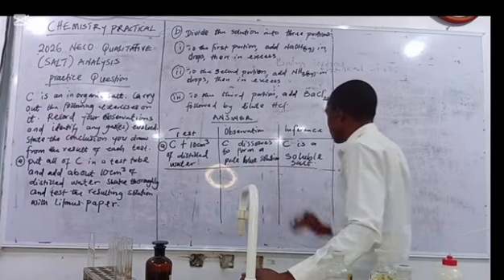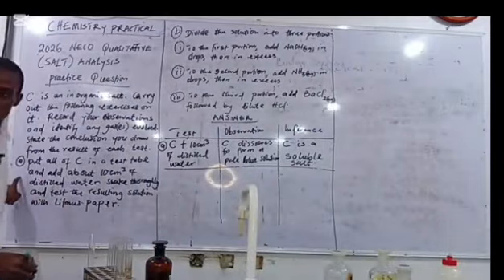C is a soluble salt. That is the inference for question A.